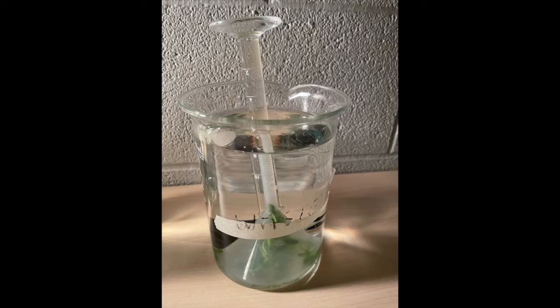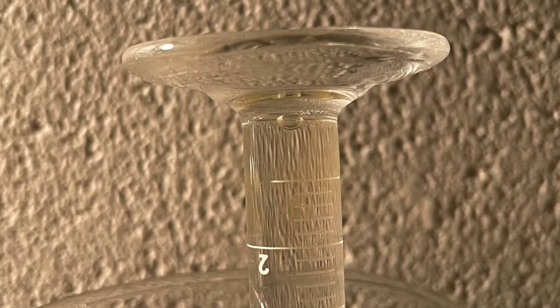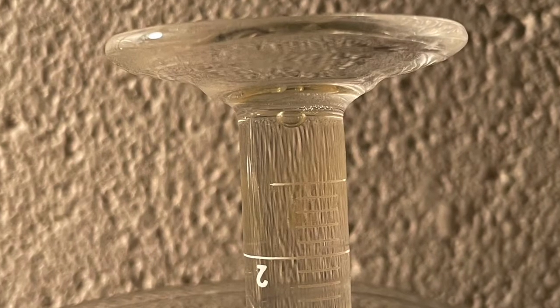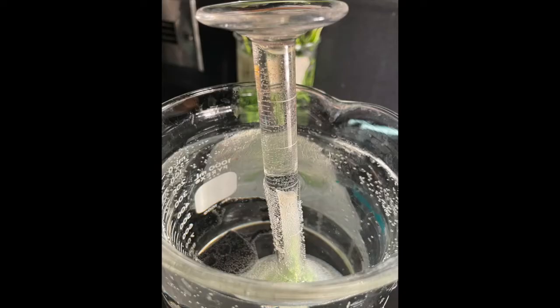Lastly, the beaker that was 60 centimeters away from the light source did not show any significant change, with 0 displacement of water. The temperature of the water remained constant at 22 degrees Celsius. However, there was a tiny oxygen bubble at the top of the cylinder, and there were a lot fewer bubbles in the solution.